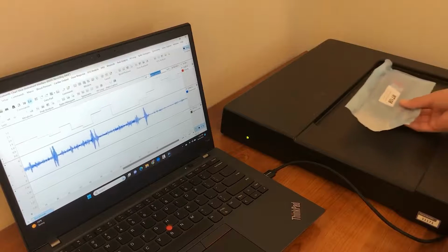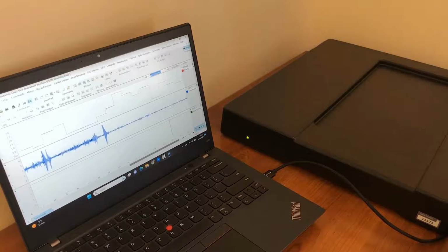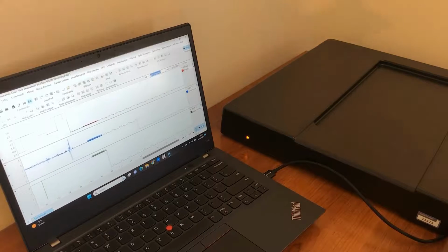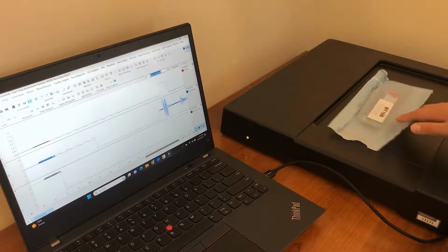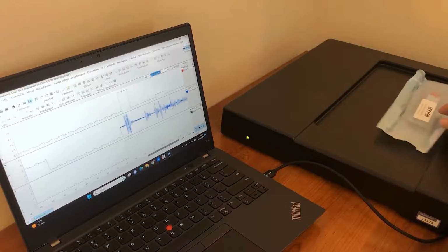The signal quality has been set pretty standard at 3 volts, but if I take the telemeter off the pad, you can see that it will drop down to 0, which gives you an indication that the telemeter is not communicating with the tBase, and so you're not recording any data. If I put the telemeter back on, you can see that it jumps right back up to 3 volts, and we are now recording activity and biopotentials again.